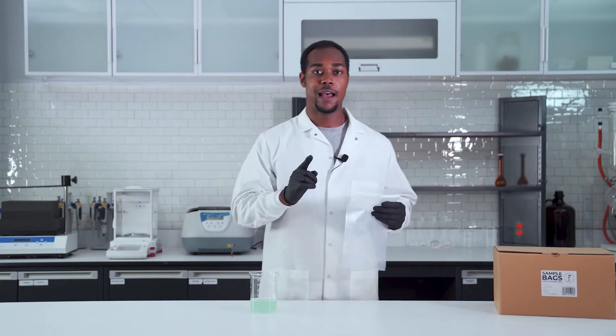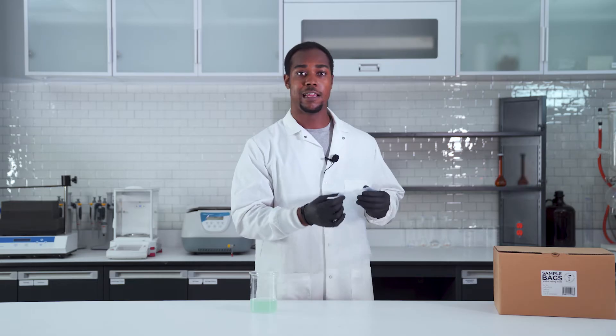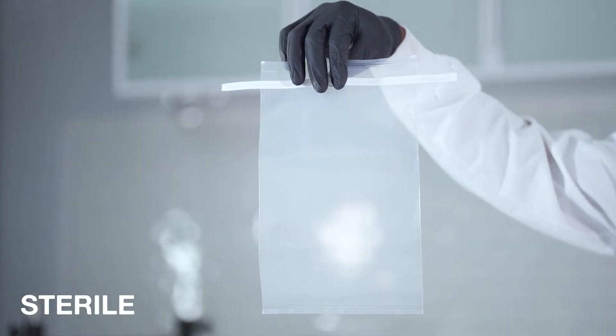It's a bag for samples. What really makes this bag so special is the fact that it keeps your sample sterile and it's also able to withstand a lot of pressure. Now let's bag it up.